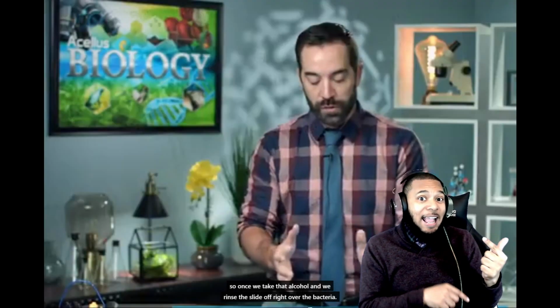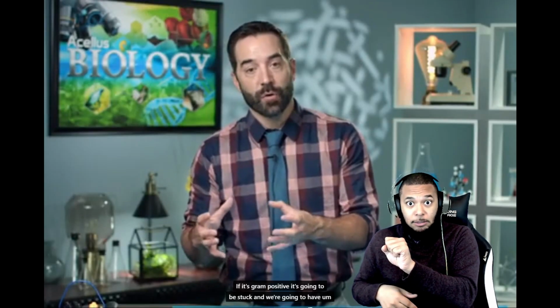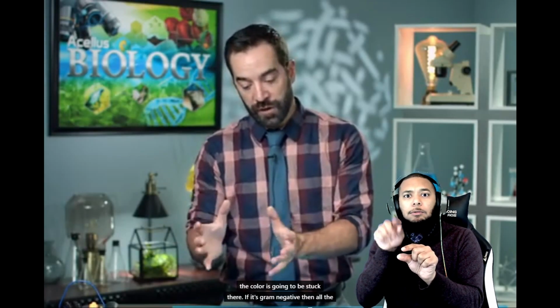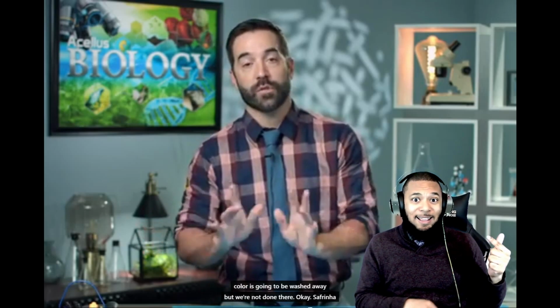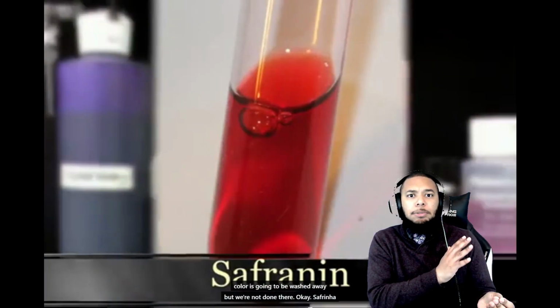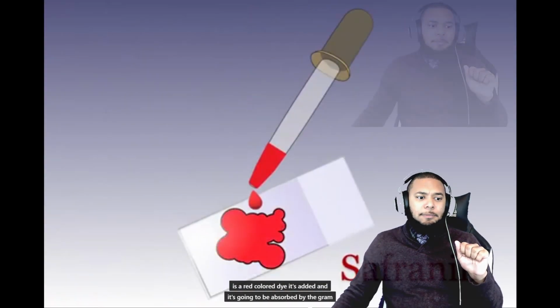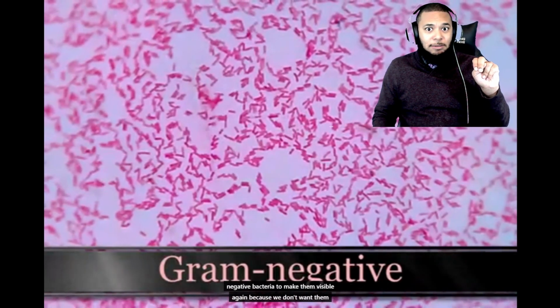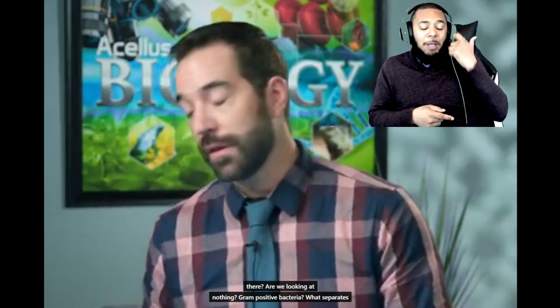Once we take that alcohol and rinse the slide off right over the bacteria, if it's gram-positive, the color is going to be stuck there. If it's gram-negative, then all the color is going to be washed away. But we're not done there. Safranin is a red-colored dye. It's added, and it's going to be absorbed by the gram-negative bacteria to make them visible again, because we don't want them invisible, because then we're like, did we wash it off the slide? Is it still there? Are we looking at nothing?